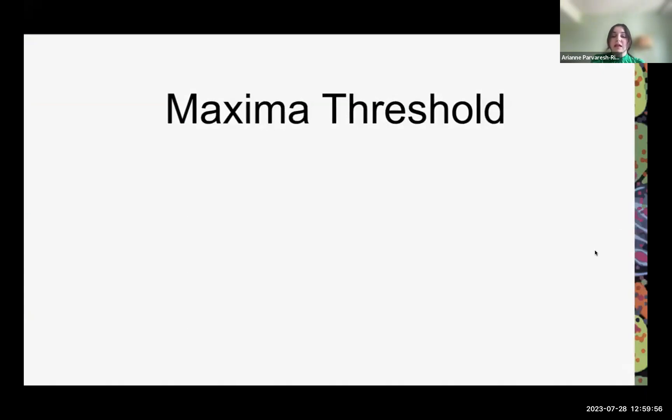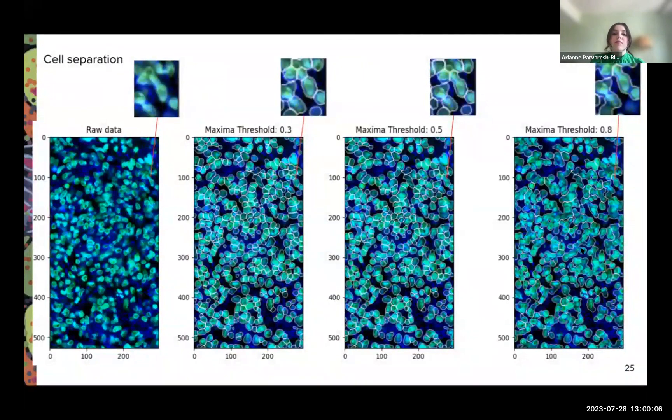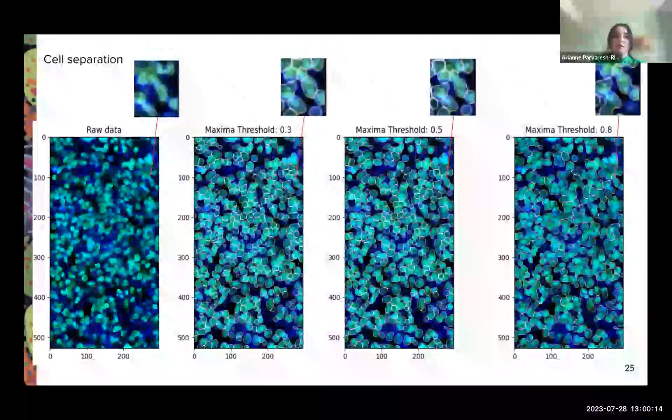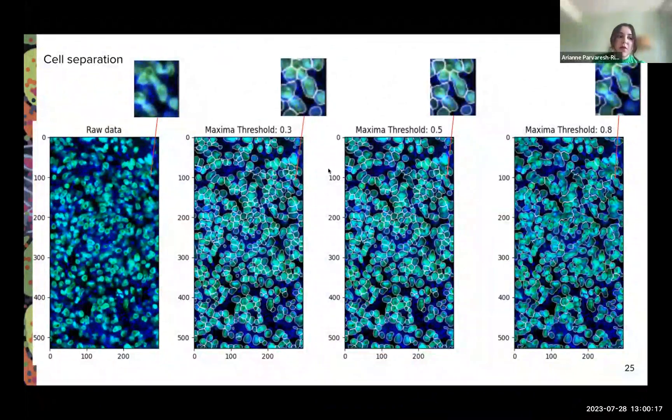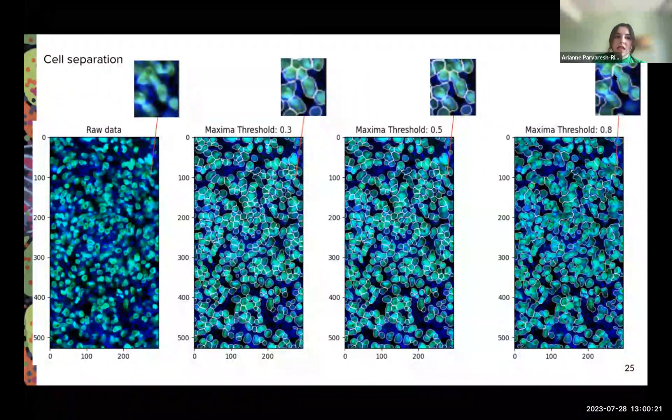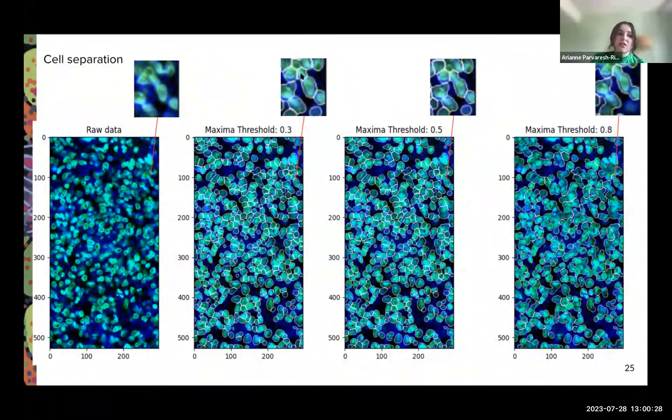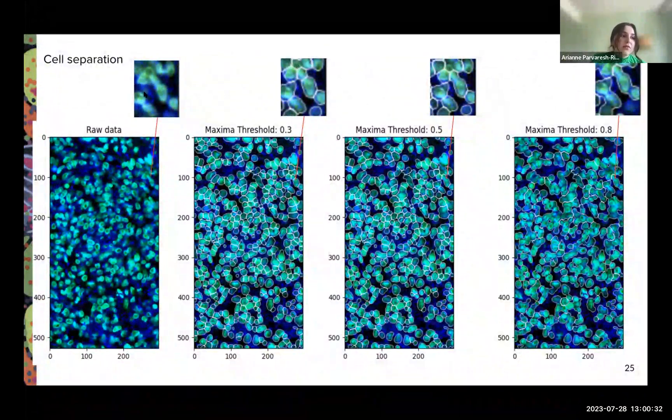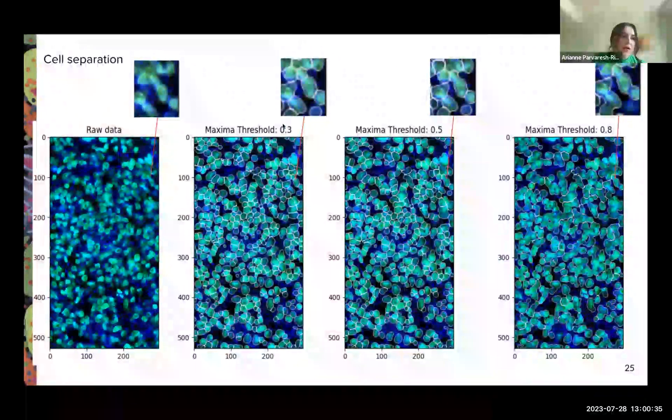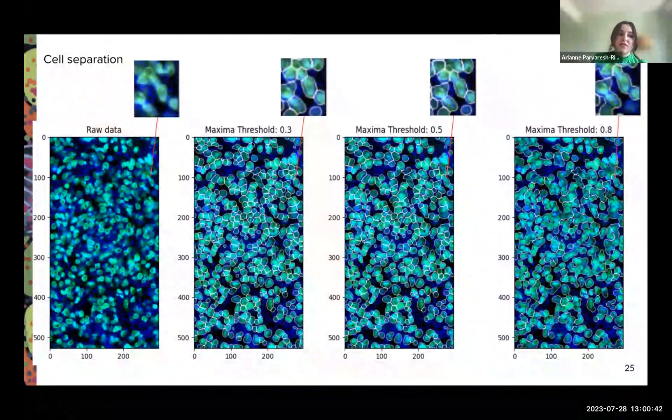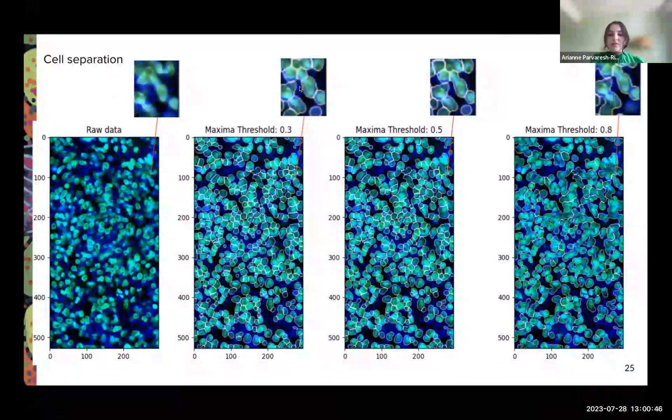The second parameter that I tested was maxima threshold. This parameter controls the model and considers what is a unique cell. A lower value results in more separate cells being predicted versus a higher value results in fewer cells being predicted. I tested three different values of 0.3, 0.5, and 0.8. A higher value results in more clusters of cells and less cells in general being detected in the sample, whereas as the values decrease, the nuclei are identified more accurately. Looking at the raw data, it can be seen how the cells are clustered. In this region, at higher values, they're considered one segment. However, as we decrease the value of maxima threshold, it performs more accurate segmentation with nuclei.